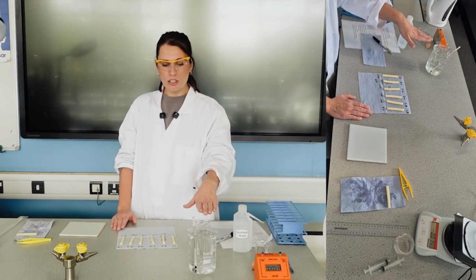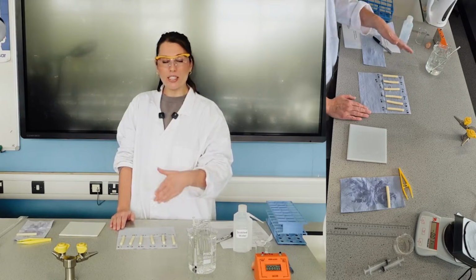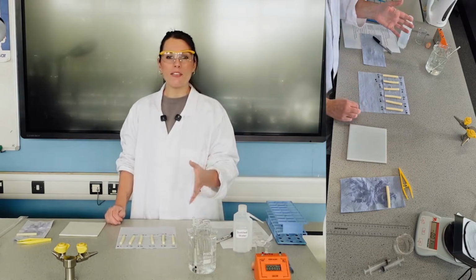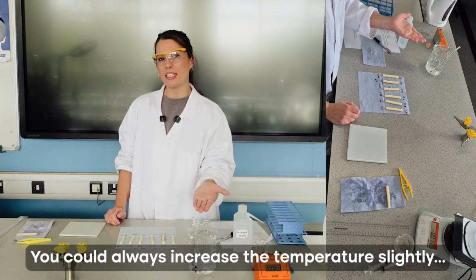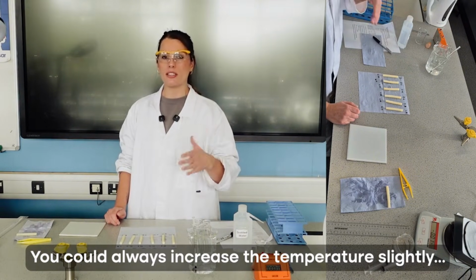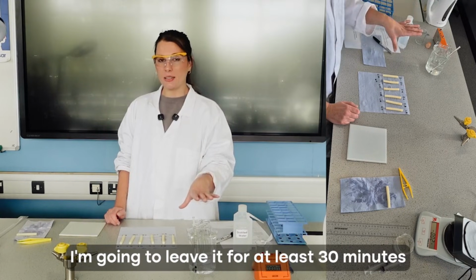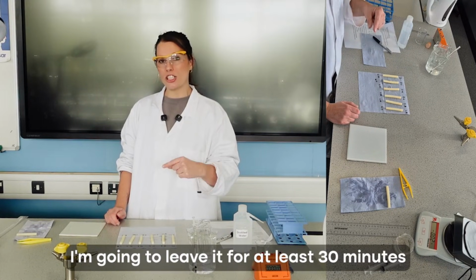Once it's then gone into the water, we'll leave it for, it depends how long your lesson is. Ideally, you want at least 30 minutes. But if you only have 20, you could always increase the temperature slightly because then you should have osmosis happening at a faster rate. But I'm going to leave it for at least 30 minutes and then we'll come back and see the change in mass.